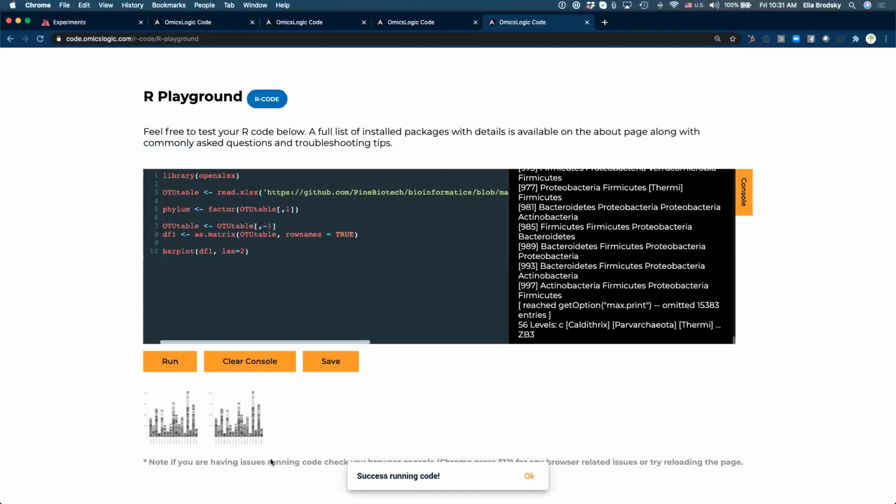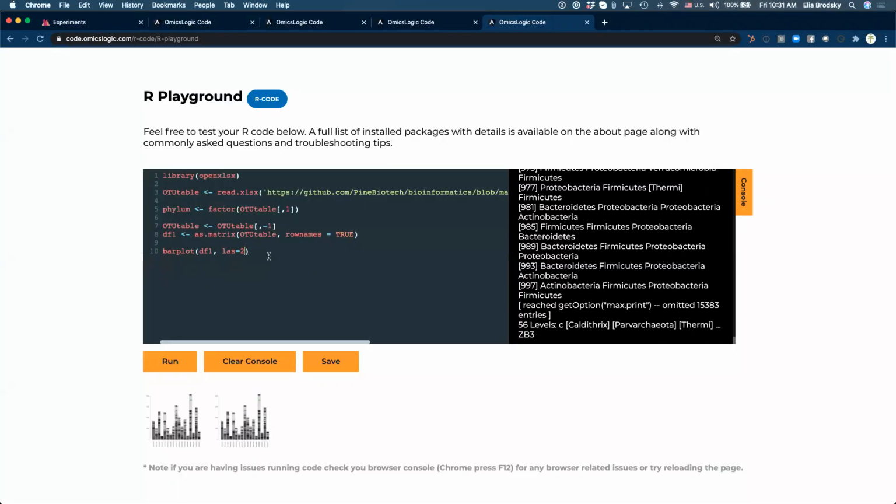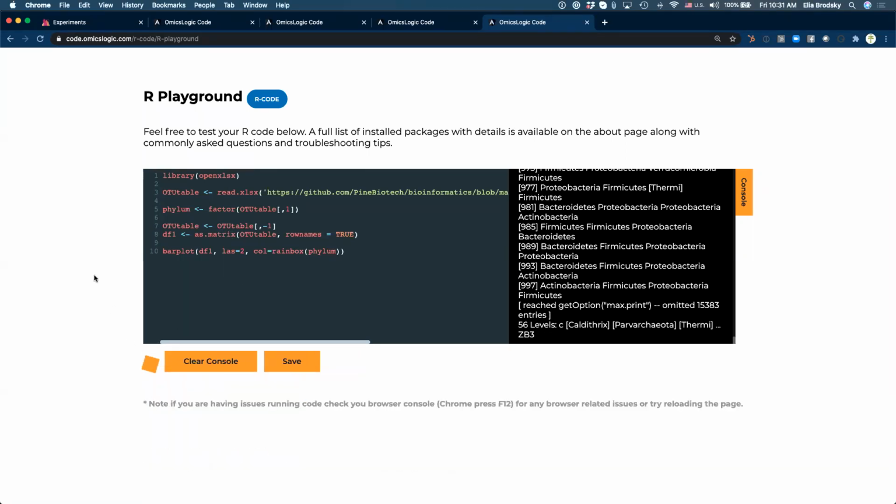Now you can see all of your samples, and obviously they're still cut off, but let's also change the colors. We can make it rainbow, and we'll use phylum as our colors.